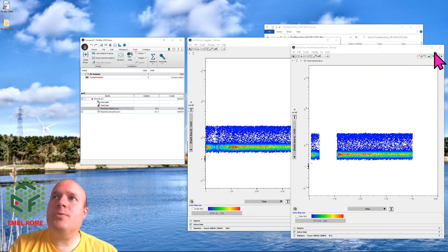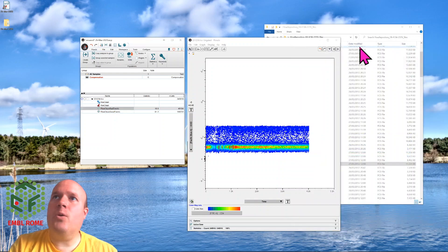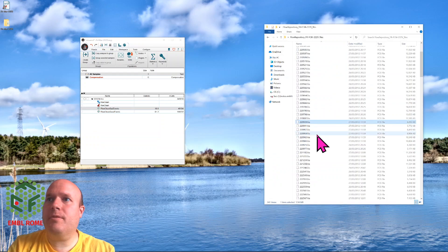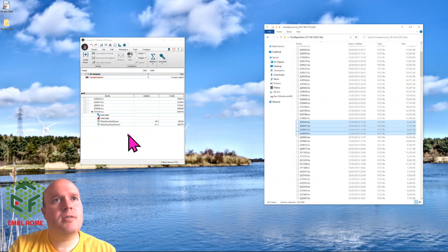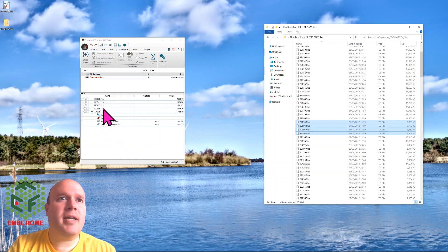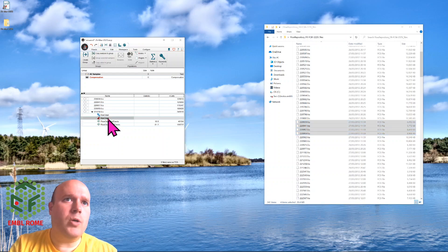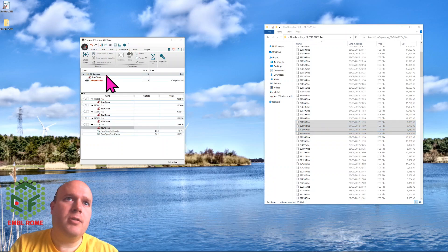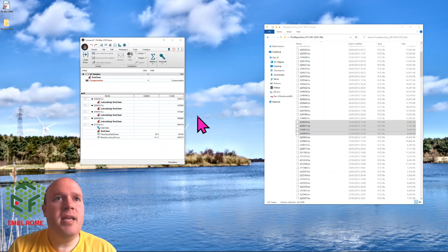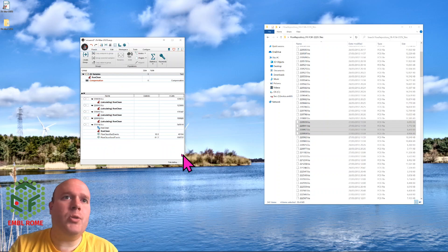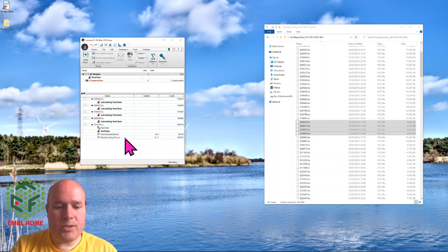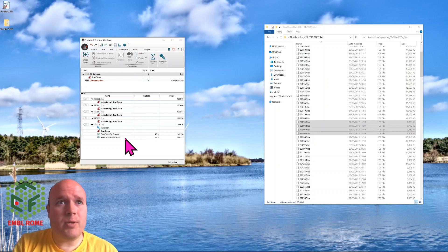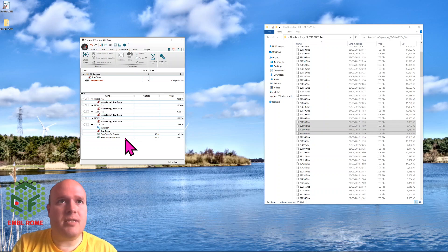If you want to do this for all of your samples, equally easy. Pick a few more and bring them across. You either can highlight them all and press FlowClean, but then you have to press OK each time, which is a bit annoying. Or you can just take FlowClean and bring it across to all samples, and then it will run FlowClean in every single one. After that, you do the analysis on good events. It's always a good idea to double-check the results are correct. You might want to play with the parameters slightly depending on the scaling of the machine you've used.